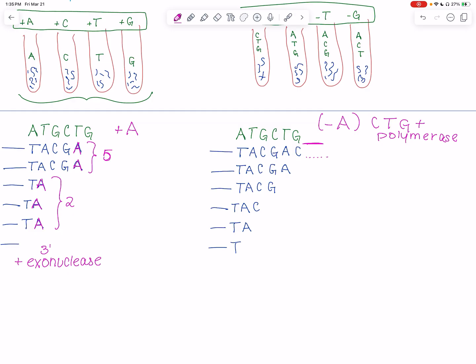Right here, the same thing would be true. We would add this cytosine and then whatever was beyond that until we reached that adenine. The next one down would actually stay that same length because of the fact we know the next nucleotide that would be added is an adenine. The next one down after that, we would be able to add this guanine in place, but nothing beyond that because again, where we're missing is this adenine, so this one would be blank.